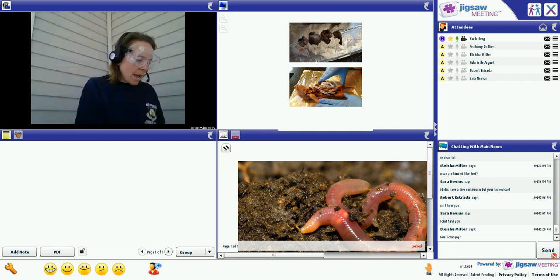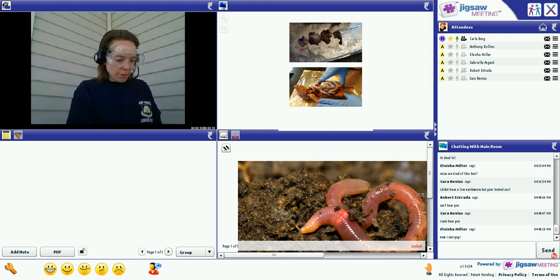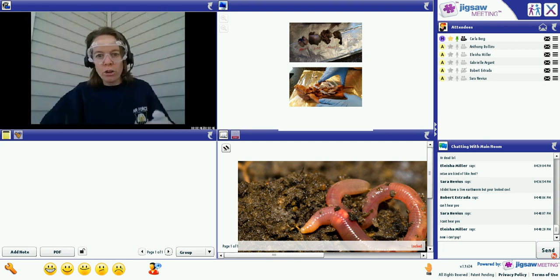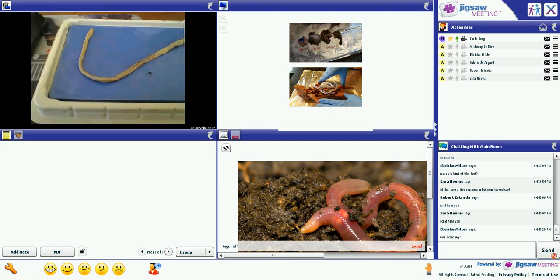All right, so we are all here now. Now what we are going to do is take our scissors and carefully cut using just the very tips of our scissors. We are not going to put them far into our worm. We are going to cut the worm all the way to its head. You may need to turn your dissecting tray so you can get a better angle. Your worm is not all of a sudden going to just flip open.